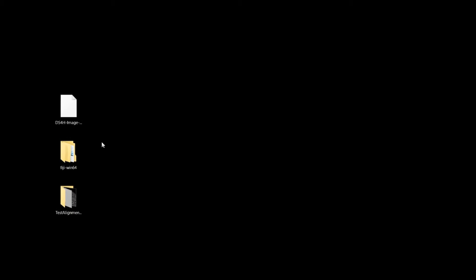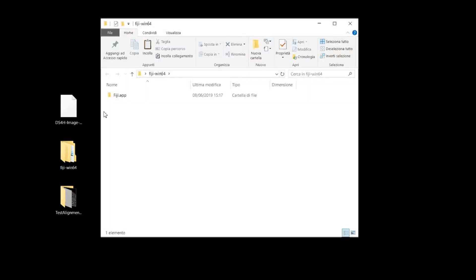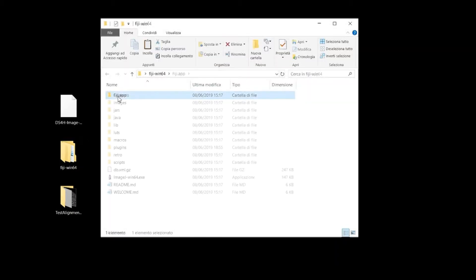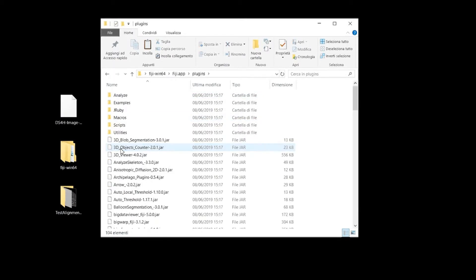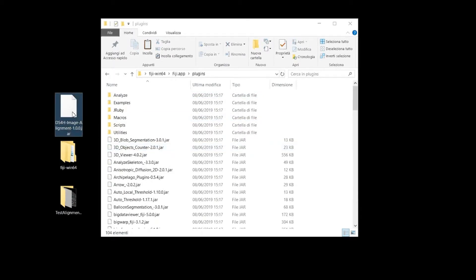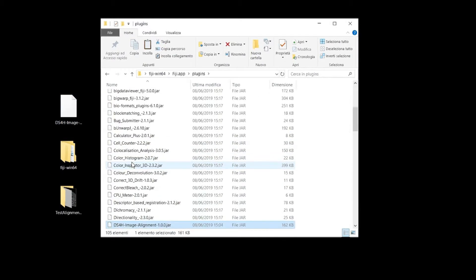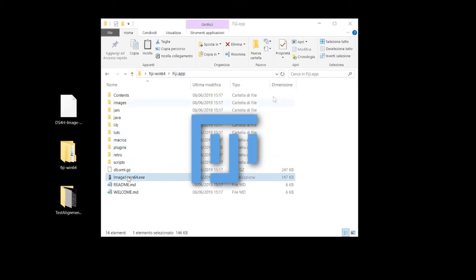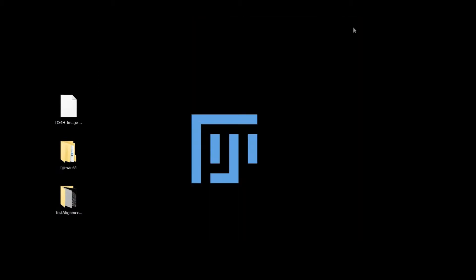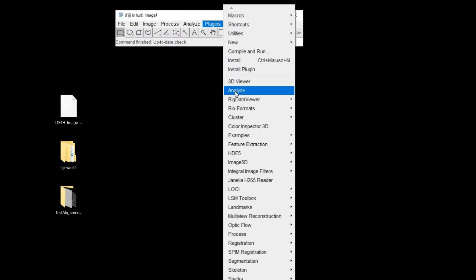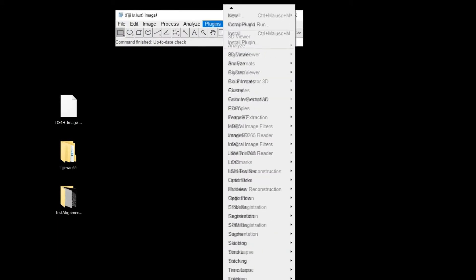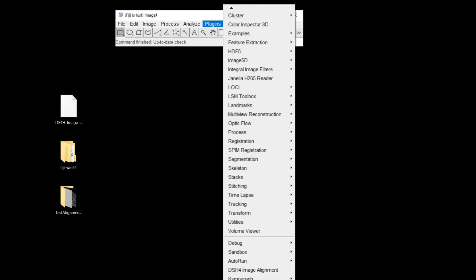Let us open the Image Alignment plugin and load the sample data set. As I said, the first operation is to download Fiji and copy in the plugin folder the JAR file of our tool. The launcher button of the plugin then appears under the list of installed tools in the Plugins section.